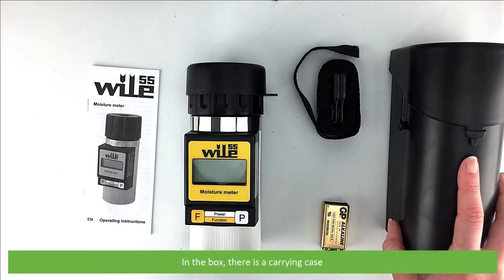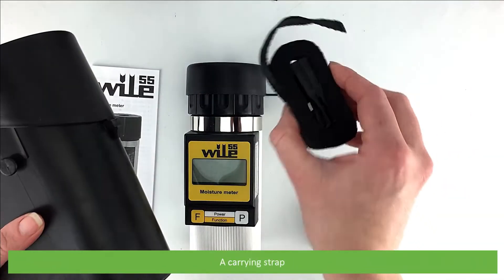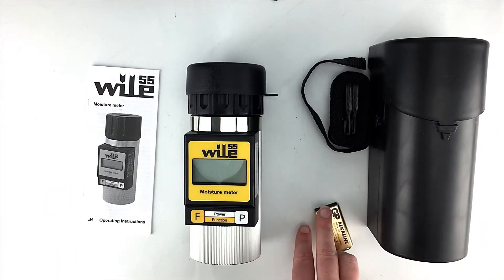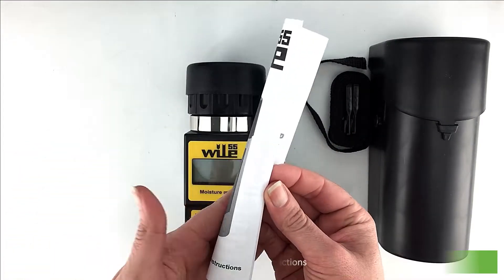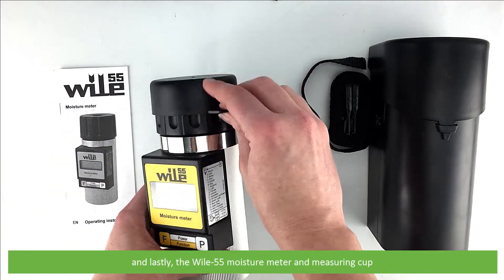In the box there is a carrying case, a carrying strap, a nine volt battery, the operating instructions, and lastly the Wile 55 moisture meter and measuring cup.